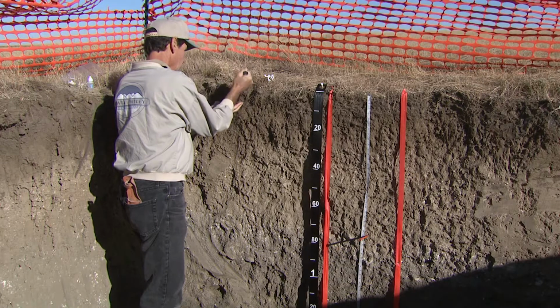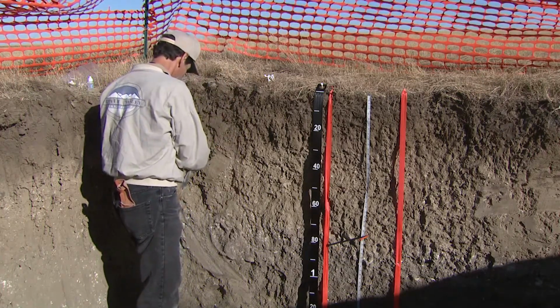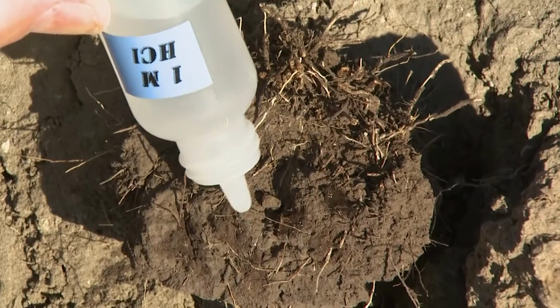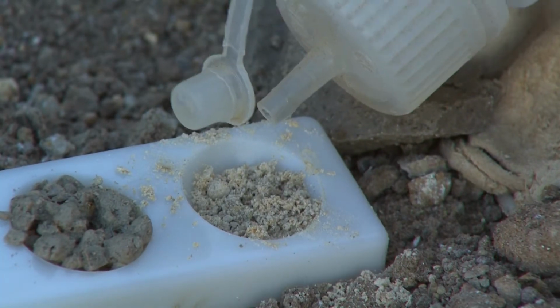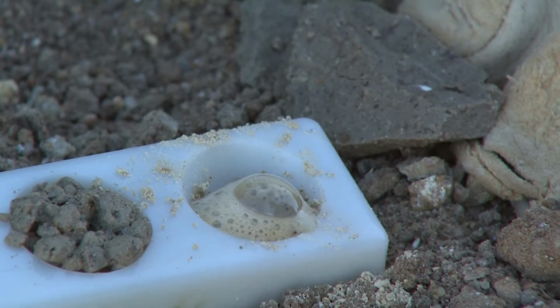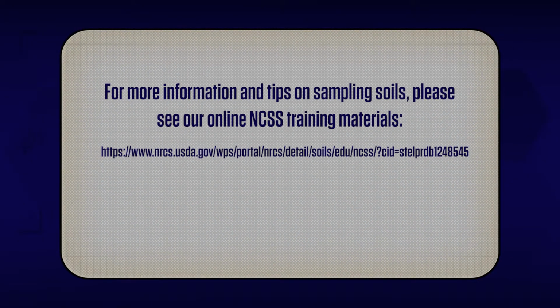This job aid is designed to help you describe and record common chemical responses in the soil using NCSS guidelines. Some soil investigations may require additional field or laboratory chemical response measurements depending on conditions. An experienced soil scientist can help you develop your technique for collection and recording of measurements. As with any new skill, proficiency comes with practice. For more information and tips on sampling soils, please see our online NCSS training materials.